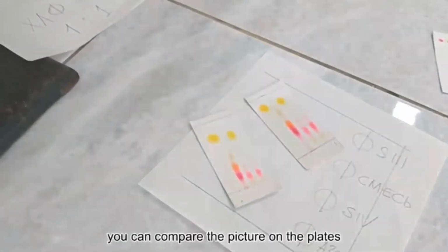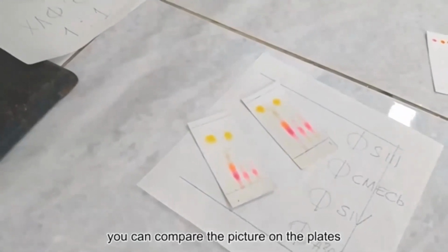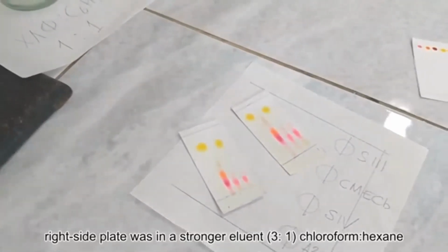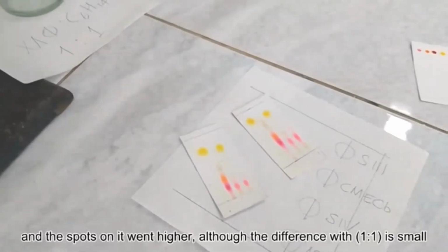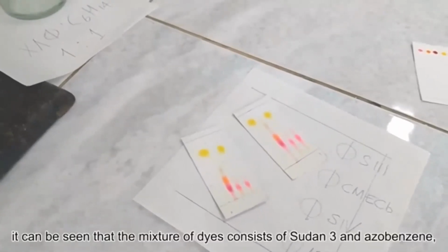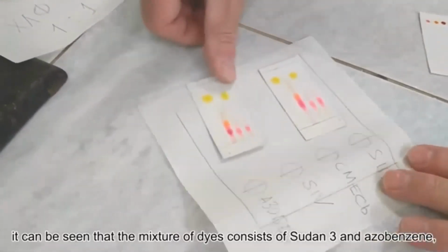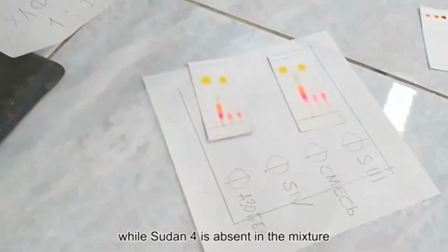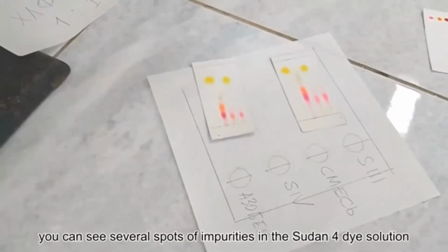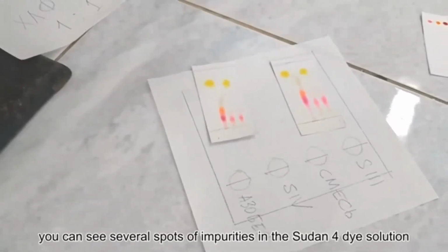Вот так можно сравнить, пожалуйста. Хлороформ 3 части на 1 гексан работает более сильно, продвигает, хотя разница небольшая, что удивительно. Ну и видно, что смесь, это третья линия, состоит из Судана 3 и азобензола. Вот схемка как раз тут есть, пожалуйста. А вот в Судане 4 есть примеси. Черное что-то пробежало вперед, потом оранжевое есть и еще пятно, которое отличается от Судана 3.